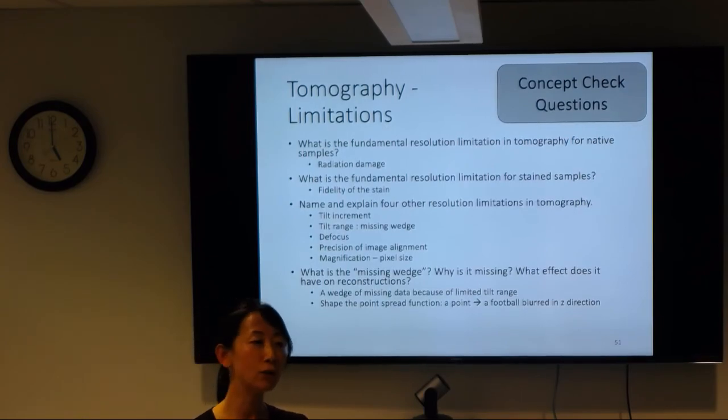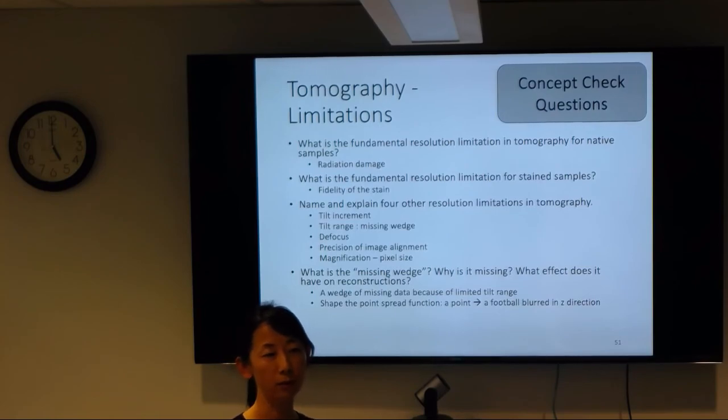And then defocus is a balance between contrast and resolution. And then alignment: you want to do very good alignment. Make sure each image in the tilt series is very well aligned to the next one in terms of XY translation. And you also want to make sure you define your tilt axis rotation and position very nicely. And that's all we want to cover for today.